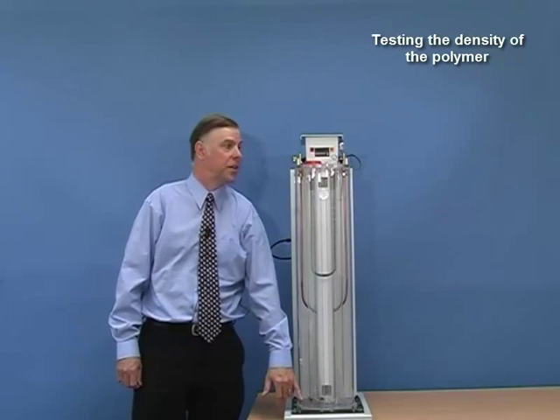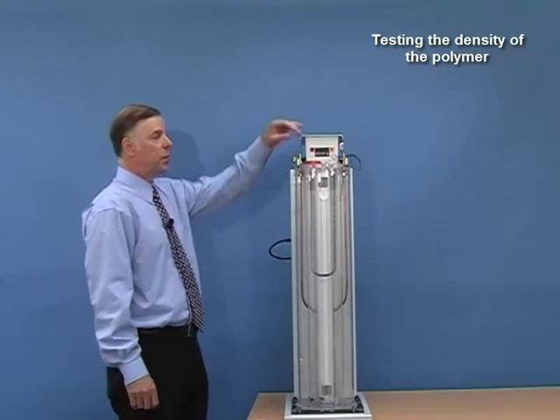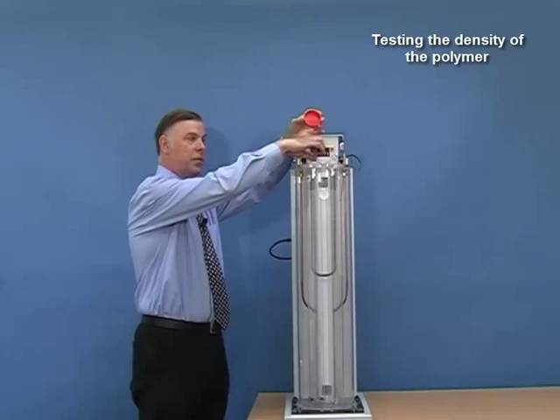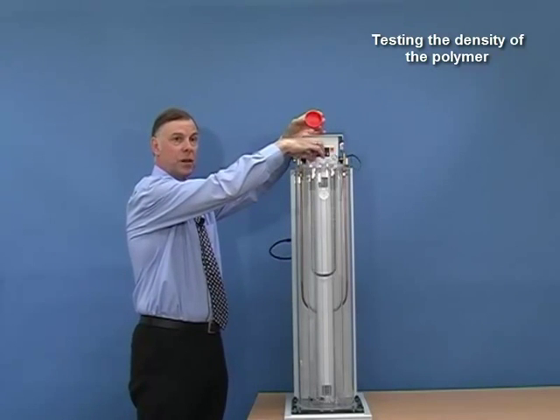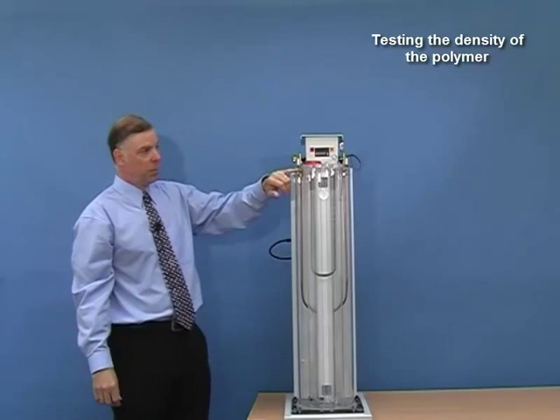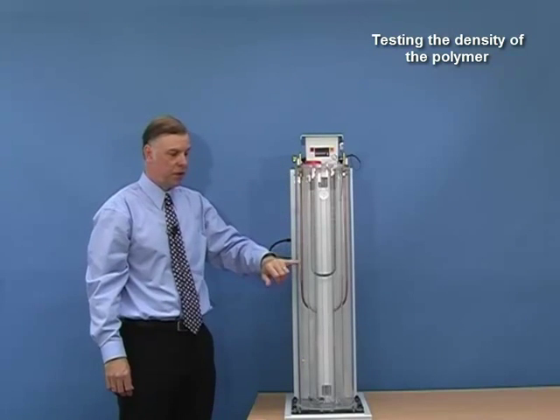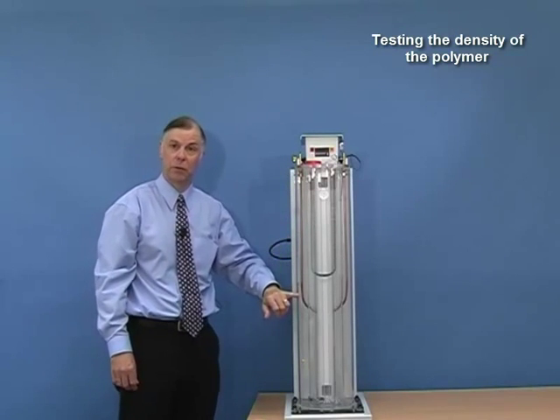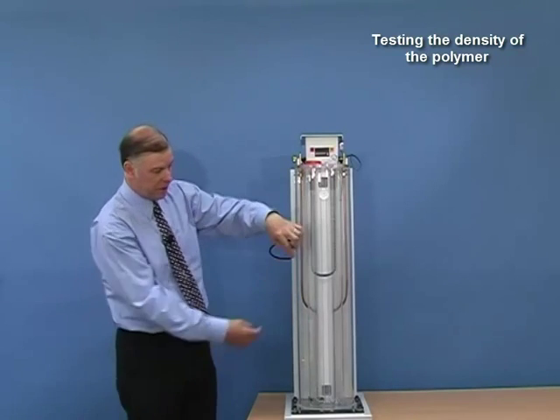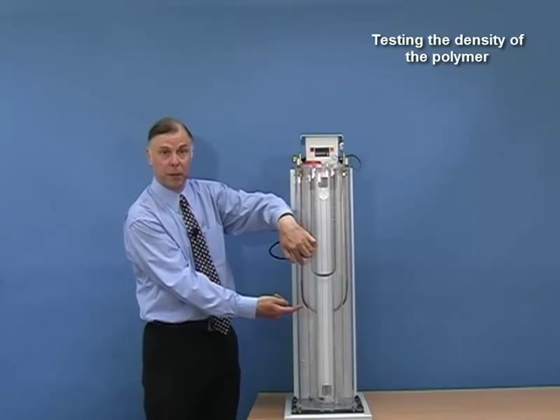To test the density of the polymer, just remove the cap, carefully introduce the sample into the top, and replace the cap. The sample will very slowly sink in the fluid until it reaches its own density, when it will stop. The exact density is then calculated by the known densities of the floats above and below it.